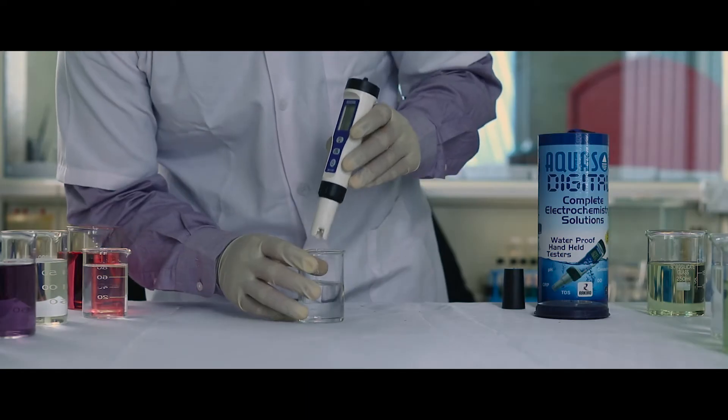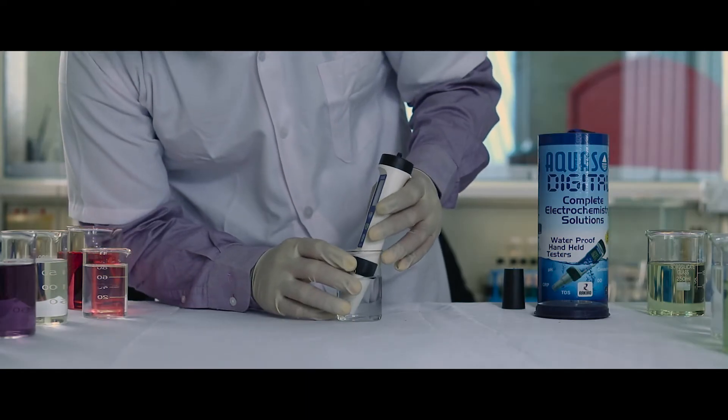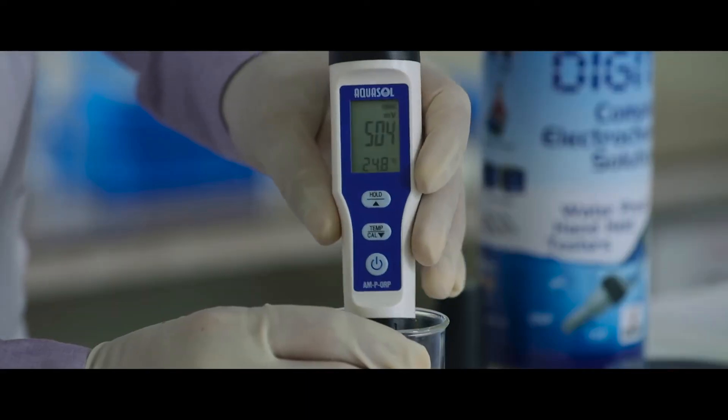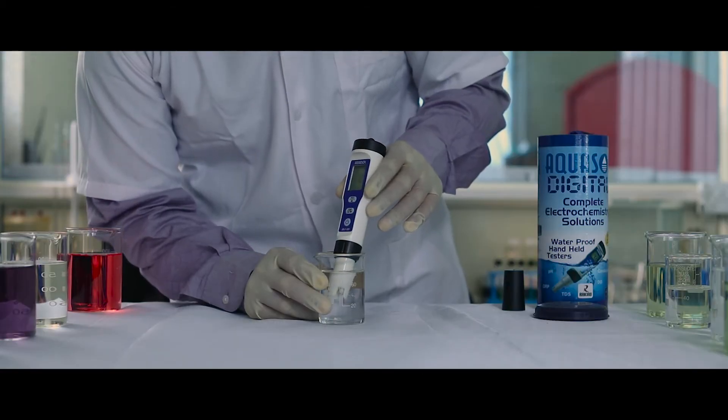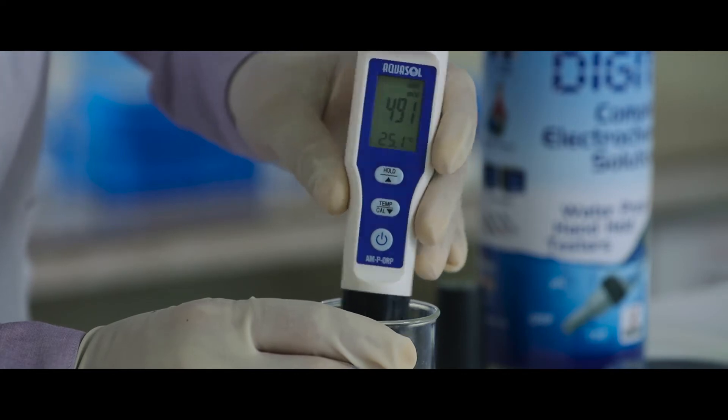We can start the test. Dip the electrode in the sample solution. Stir gently for a stable reading. Note down the ORP of the sample.